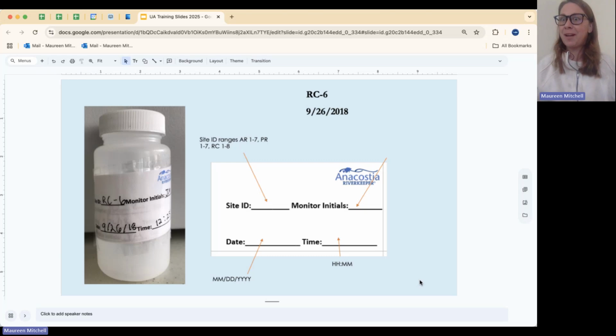I, in the lab, have a couple hundred samples I'm processing each day, and I always want to process them based on when that sample was taken. Knowing when that sample was taken allows me to make sure that I always process samples within the 5-hour holding time. That's why I'm asking you to monitor a specific time and get the samples to me as quickly as possible, so I can process all of them within the allotted 5-hour holding time that I'm told by my manufacturer to do.